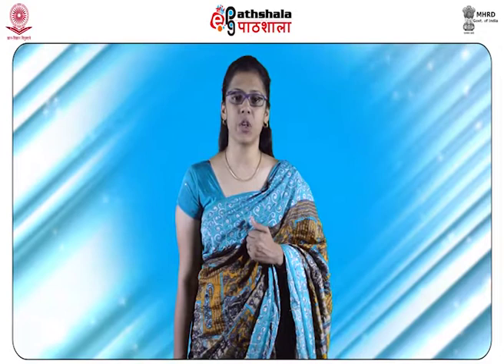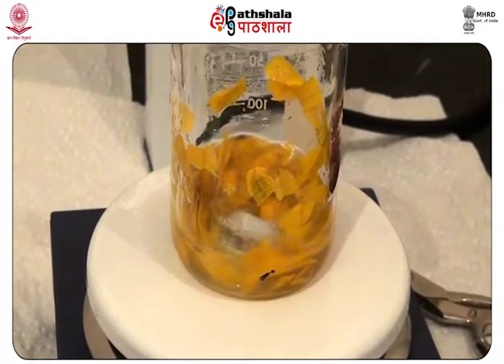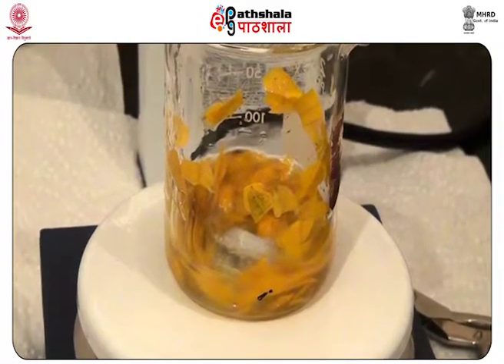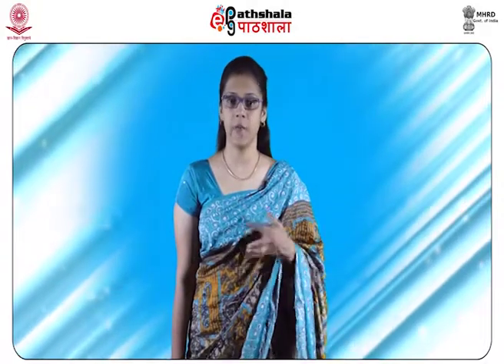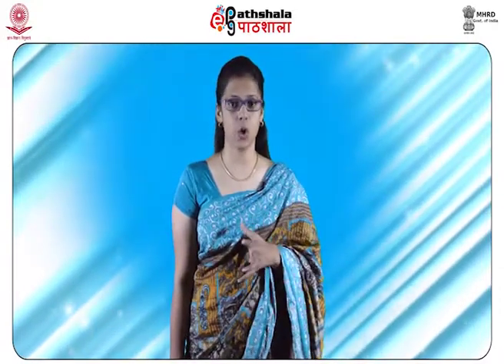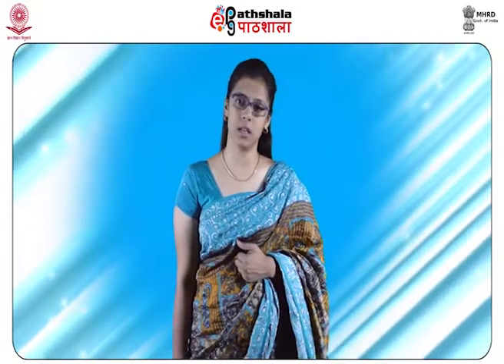First is the dye extraction. Dye extraction is the first and the basic step in the analytical process of dye and fibers. Varieties of solvent have been introduced for a number of extraction schemes. These extraction schemes vary but have basically the same aim, which is to not only extract the dye but also be classified in TLC, which was normally applied for the purpose of identification and separation.